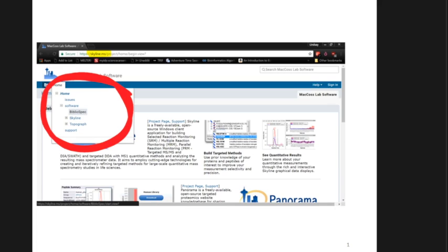So this morning, Sue walked you through the mass spectrometer side of the method, but I think almost everyone in here is hyphenating their mass spectrometry with liquid chromatography. So now we have to spend some time talking about the liquid chromatography because they really work together for getting us good data. I did want to mention to you guys, and I'm going to try to stay tethered over here so that the recordings will be okay for you to use at home.